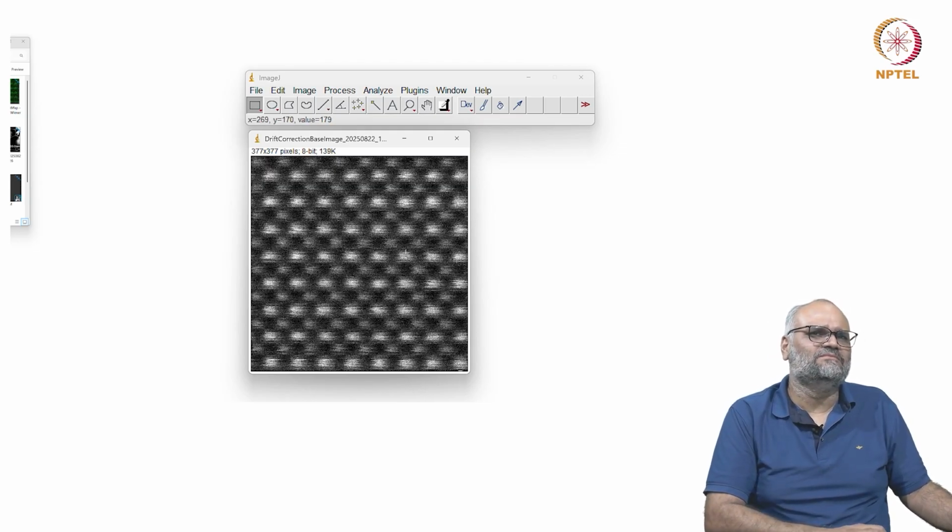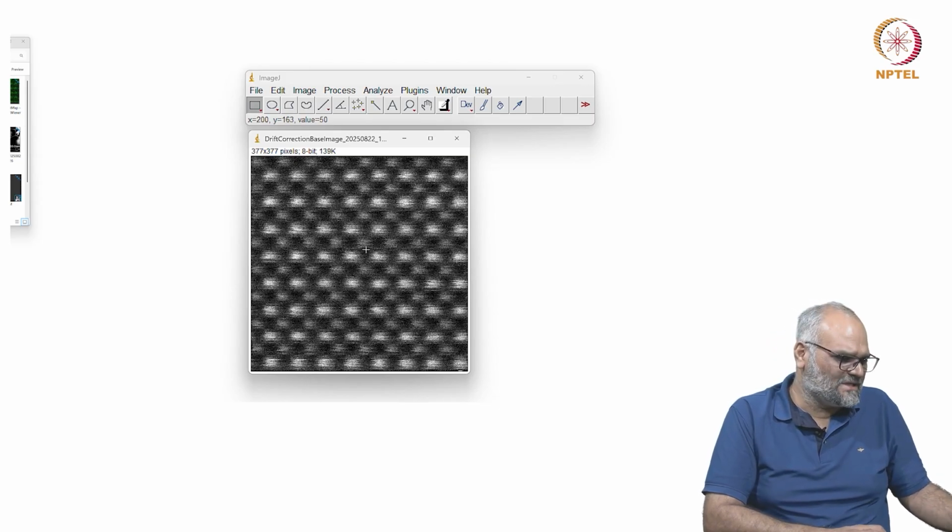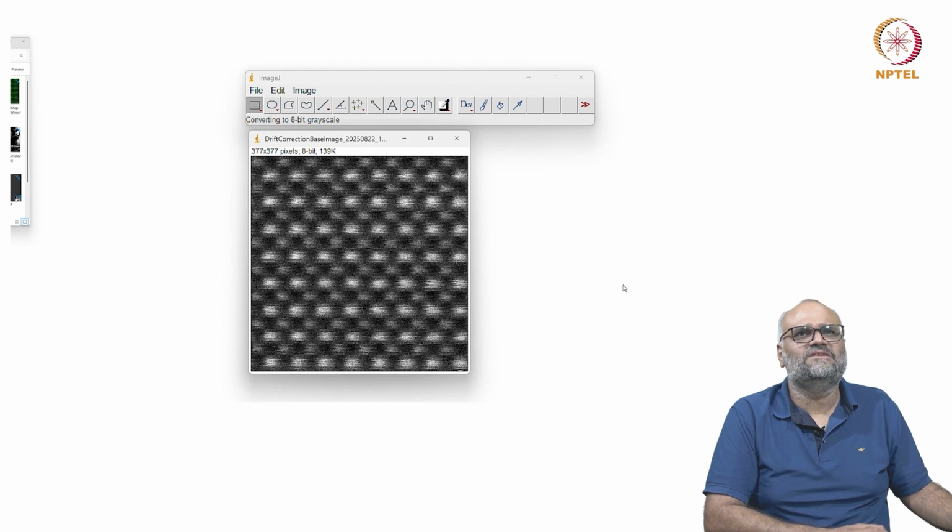You see there are some lines, and the reasons for this could be many. And here is a drift corrected image.